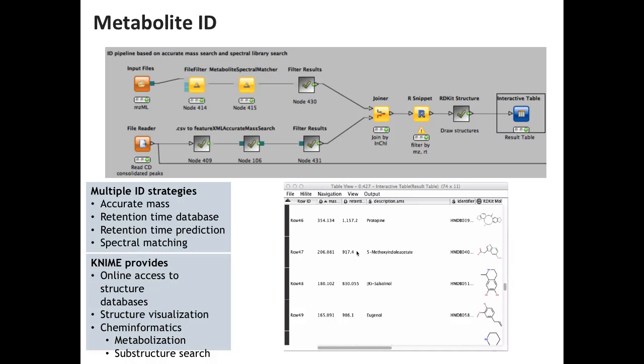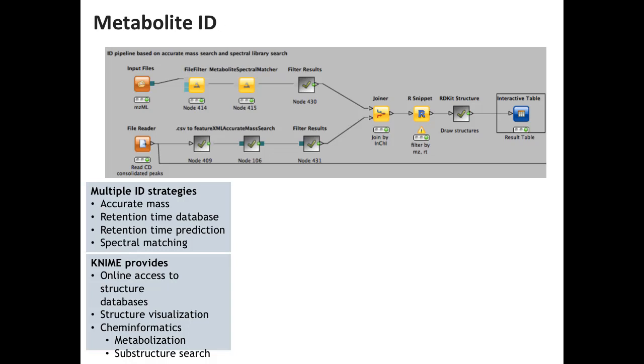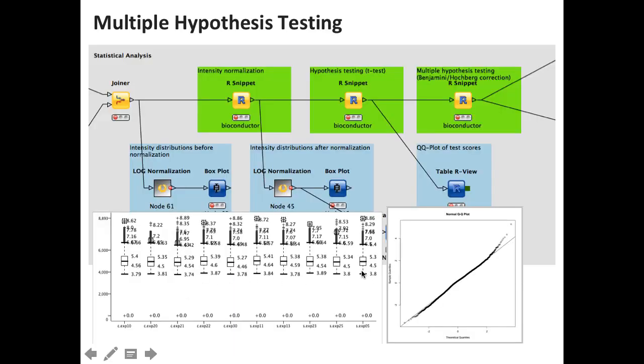Based on this, you don't really use the data as part of the normalization. No, not for the normalization. We would use that type of normalization and that type of plot for the QC. Yeah, to see if there's anything really wrong. But the QC workflow is not part of this quantification workflow. We usually do that independently. And back at the time when this particular study was done, we didn't have the QC workflow in OpenMS yet.